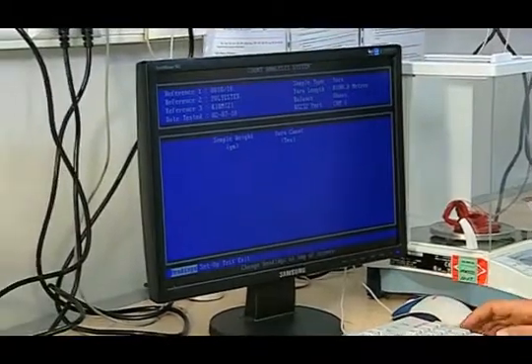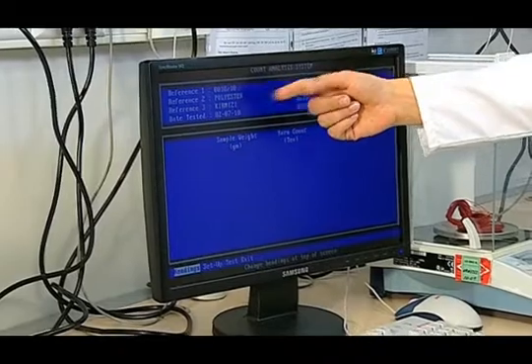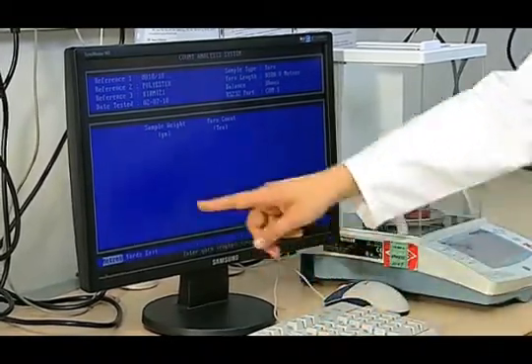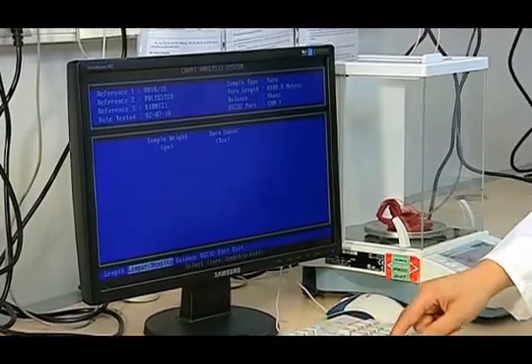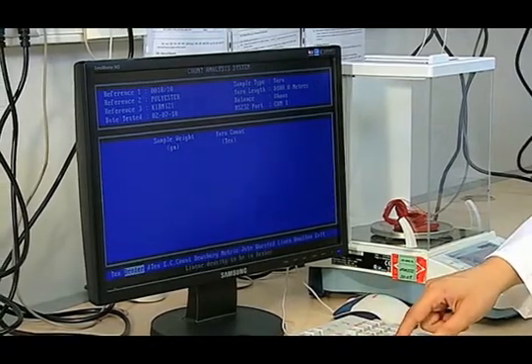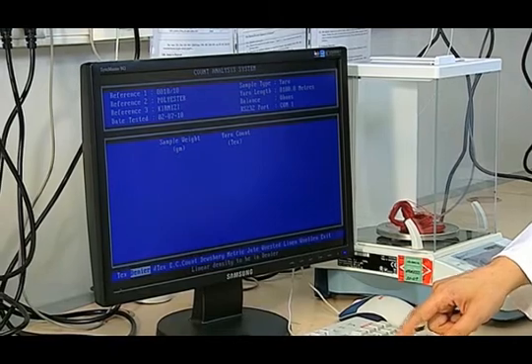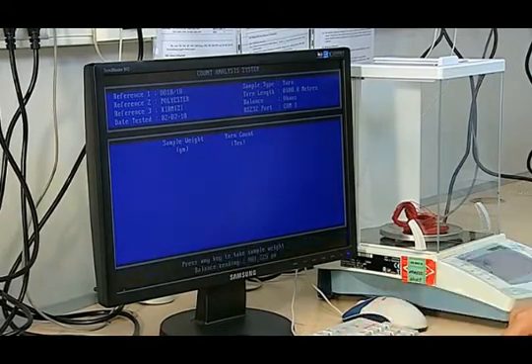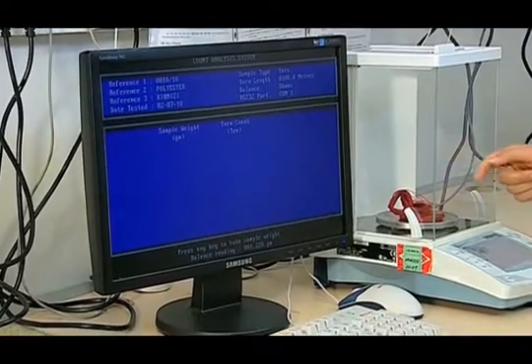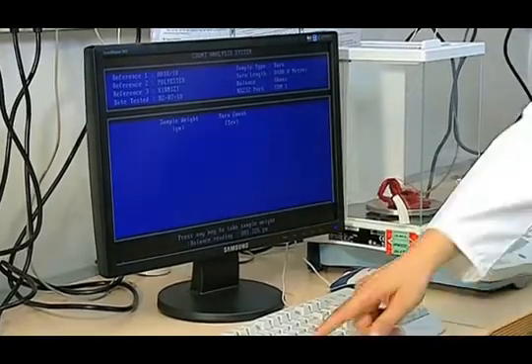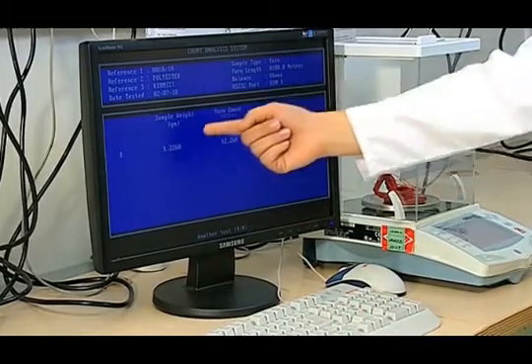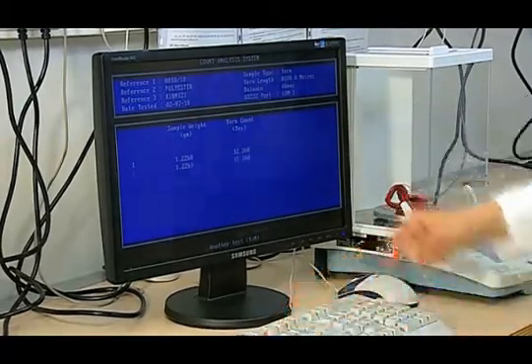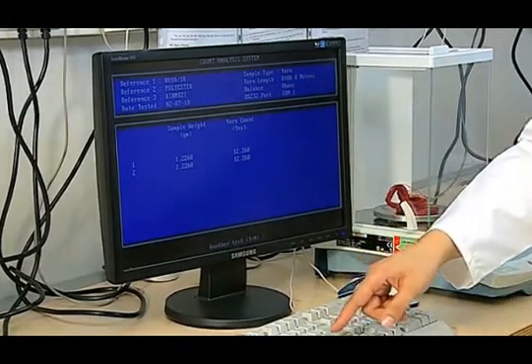Thus, the sample's data is put into the computer program. The red polyester yarn is taken as 100 meters long. The length is taken in meters. Computer programs help us to find the TEX-DENIA, English number, and French number values of the yarn. In this process, we determine the TEX-DENIA. After completing the test process, the value in grams produced by a weighing device will automatically be transferred to the computer screen. The tex number of the yarn is automatically calculated by pressing the OK button. The arithmetical mean of five separate test results for five samples is calculated by repeating this process.